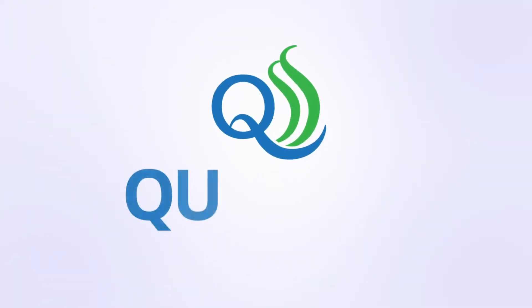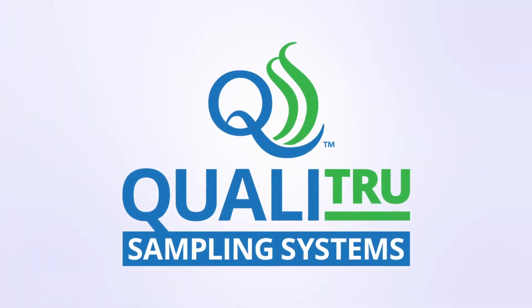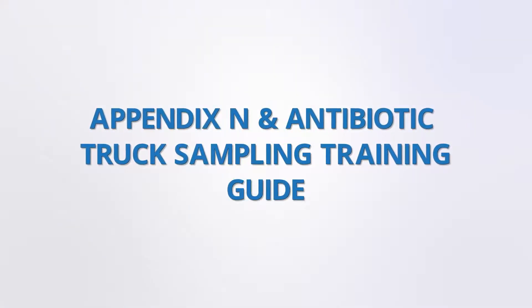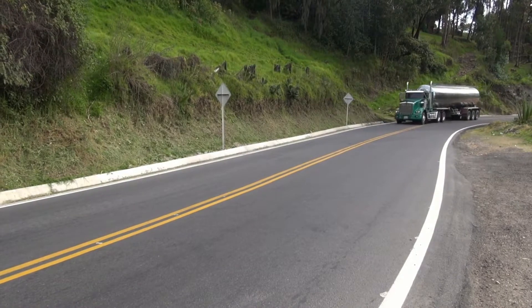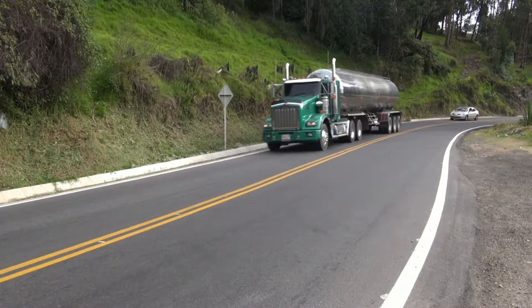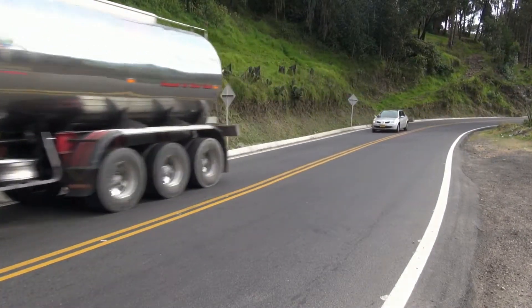Welcome to the QualiTrue Sampling System's Milk Tanker Truck Sampling Training Guide. The following tutorial will demonstrate the proper method for collecting raw milk samples from a milk tanker to be used for PMO Appendix N antibiotics testing.